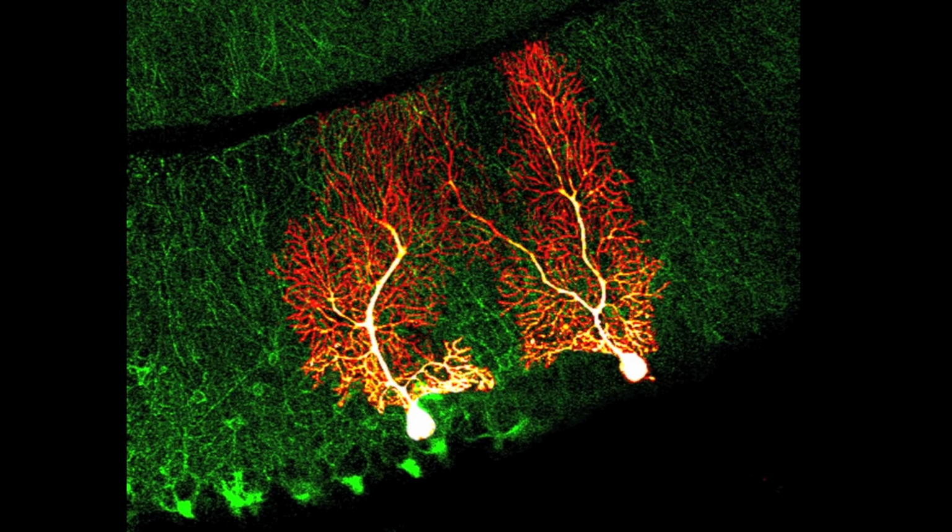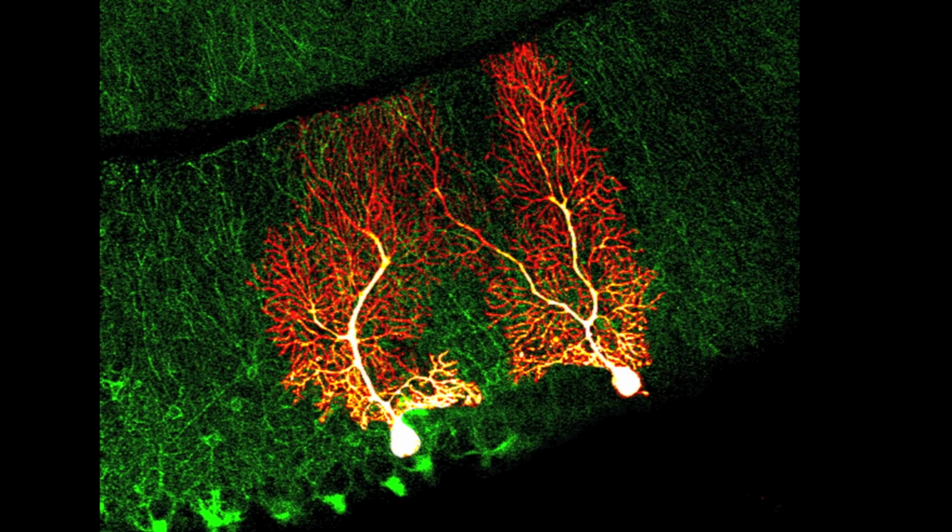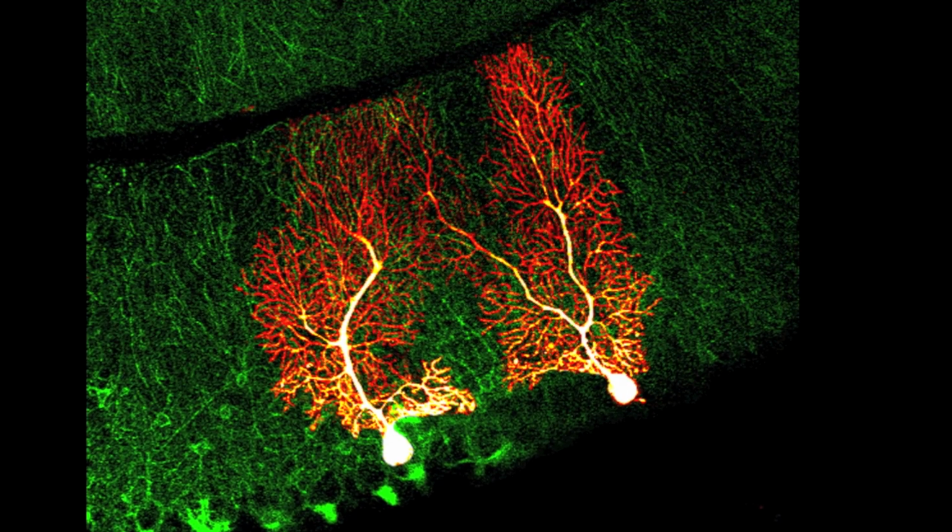It's quite hard to get such nice images and to maintain the slice long enough to do two separate recordings side by side, so that I can highlight two cells right next to each other without their trees completely overlapping. So it had a certain aesthetic appeal, and it kind of highlights how beautiful it is inside the brain.